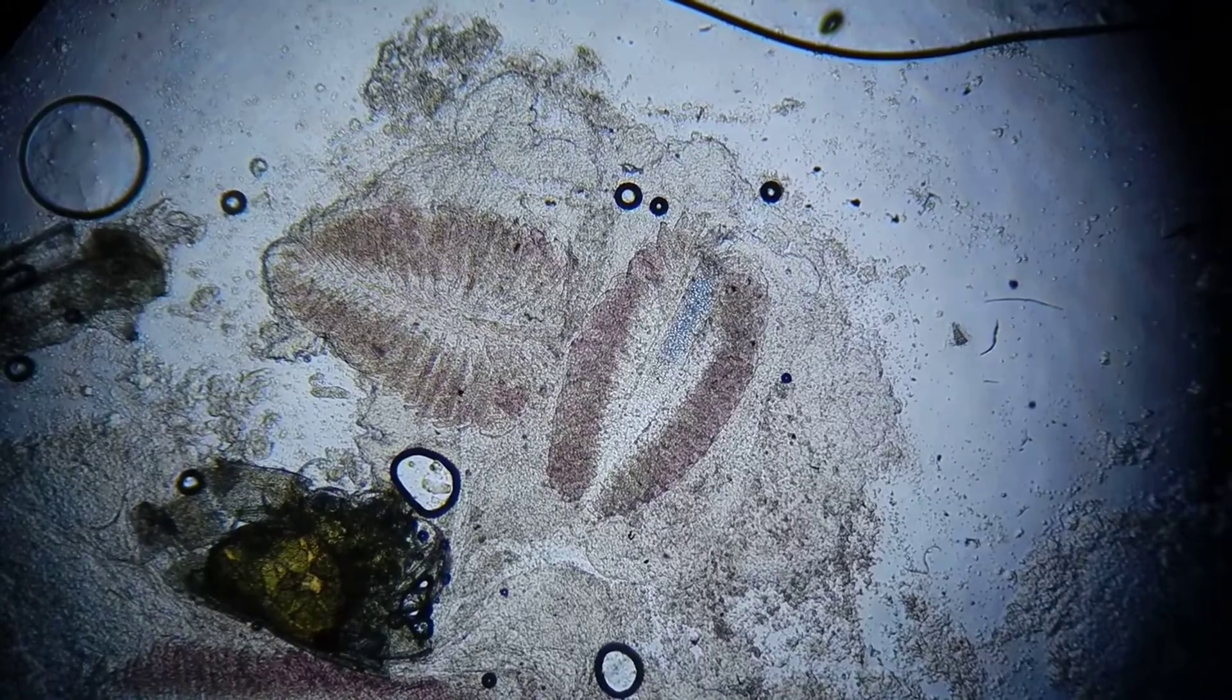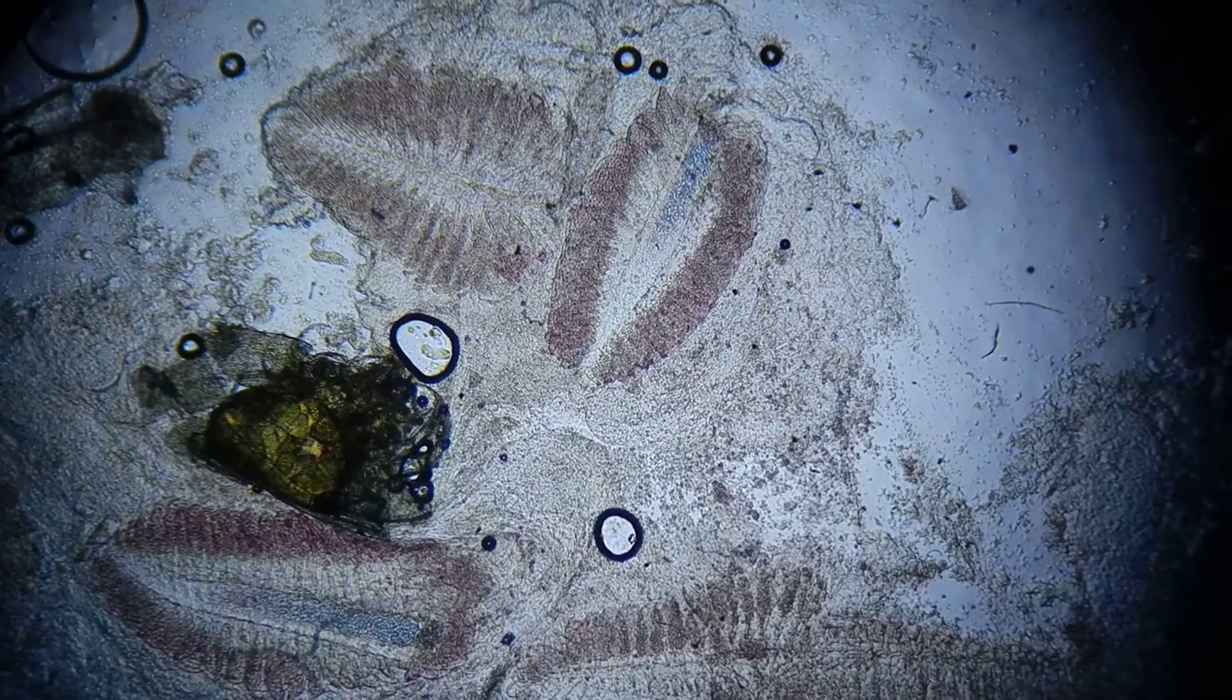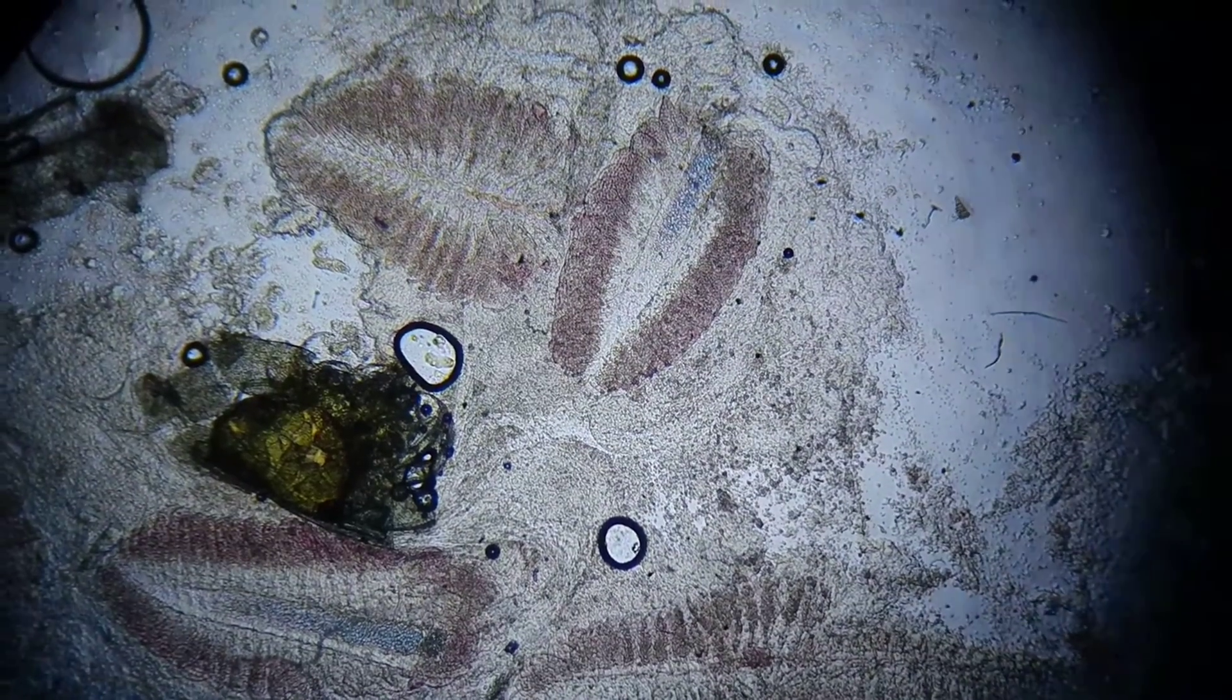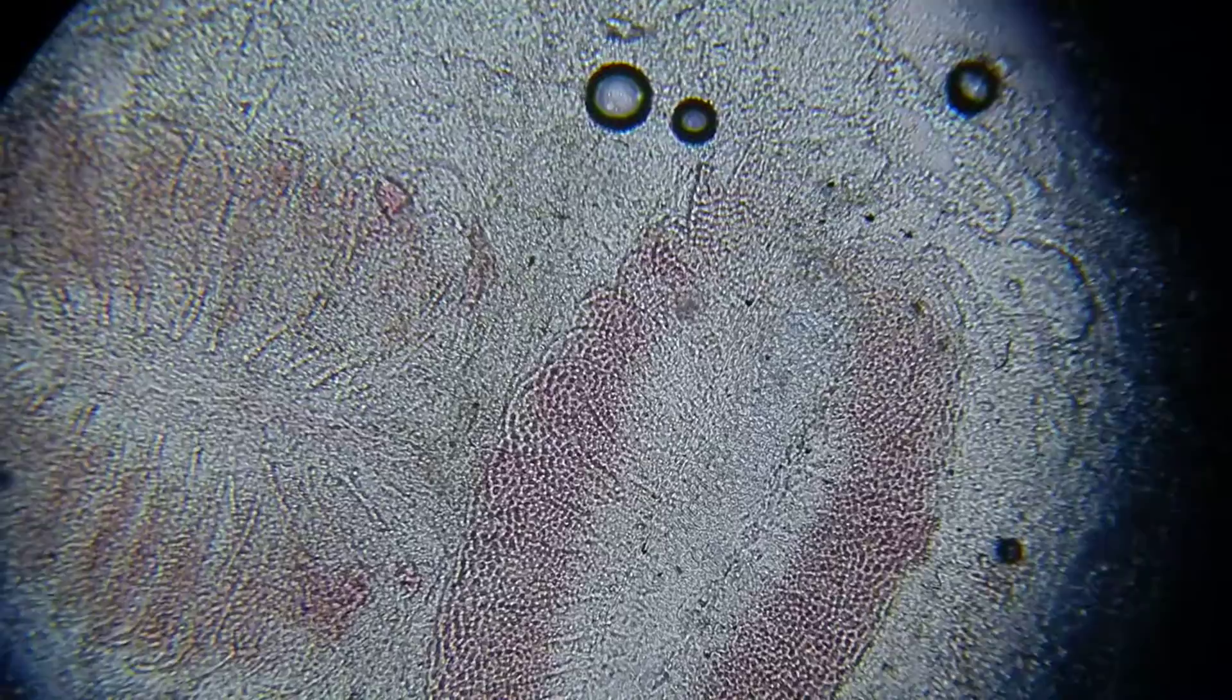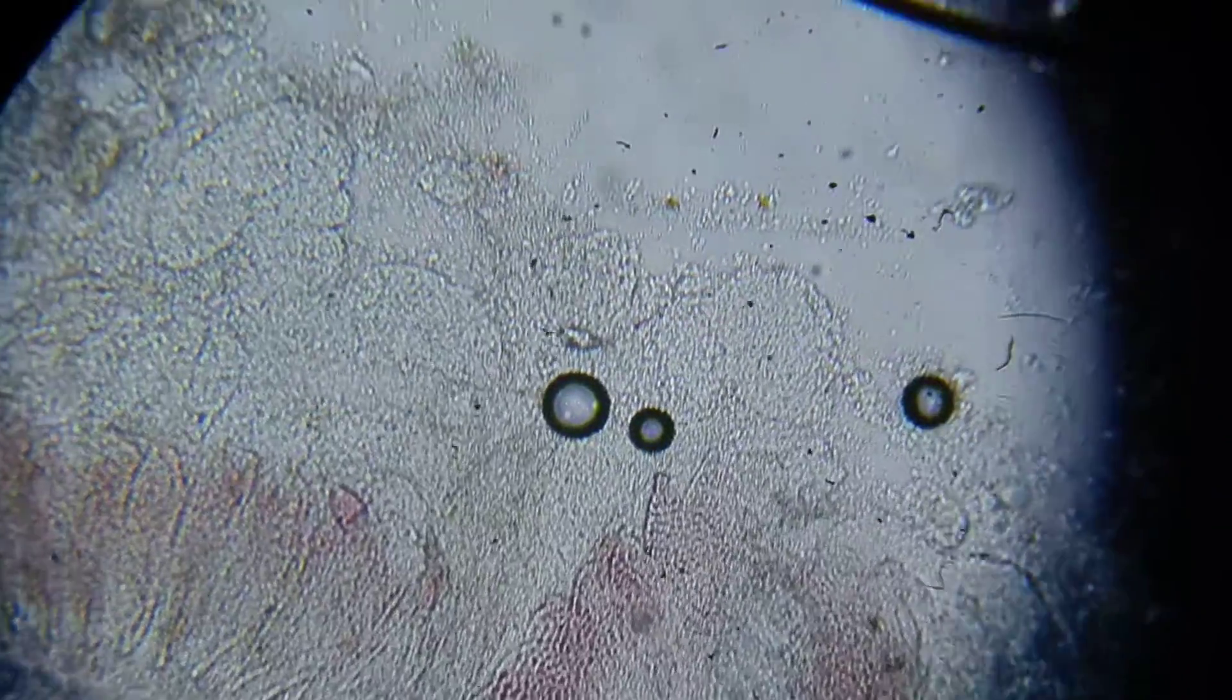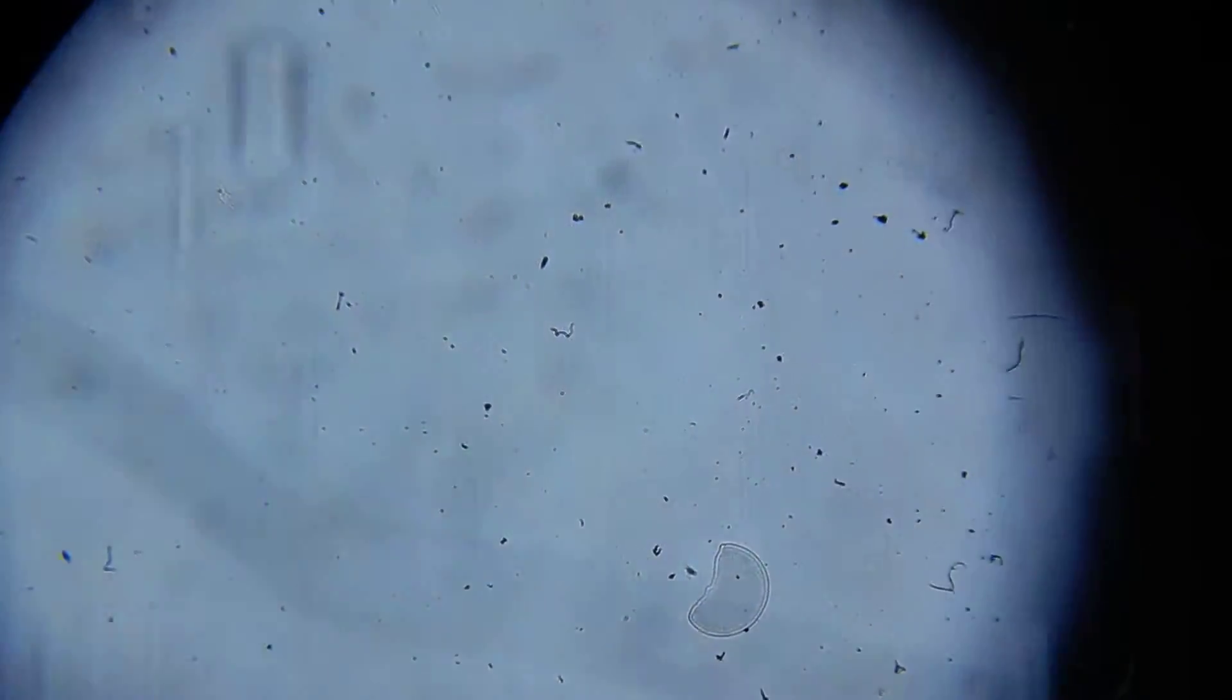is that there's a lot more mucus around. And the blood vessels look a lot more congested. You can see a lot more red in the section, in this specimen. And there's so much more mucus around. So what's causing this to happen?